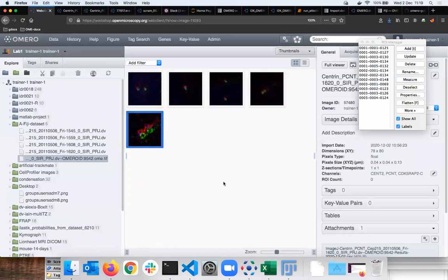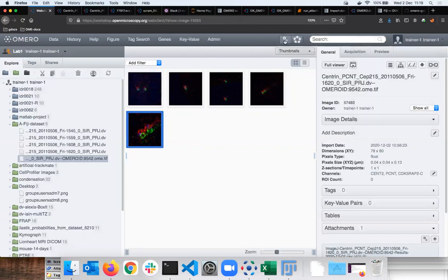Yes, in your walkthrough there is a chapter called server-side scripts, and that's what I'm going through now. In the web client, the server-side scripts are hosted here.